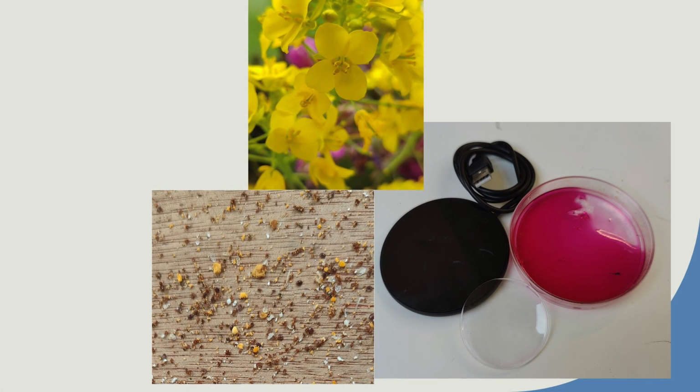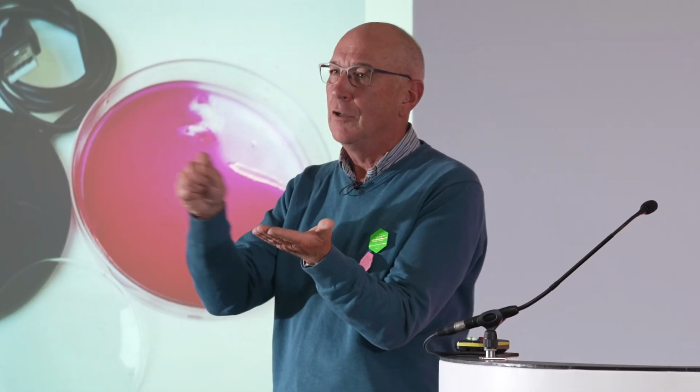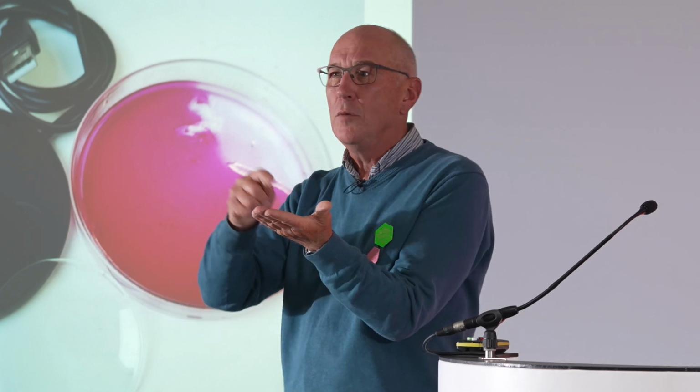So we've now got a library. We've been around, we've checked our flowers. For a couple of days in the summer or throughout the season, just put your Varroa board underneath your beehive and take it out, and you've got pollen loads. So you've got your pollen loads, and you then can make a slide with a pollen load. So you now know what your bees are bringing in.